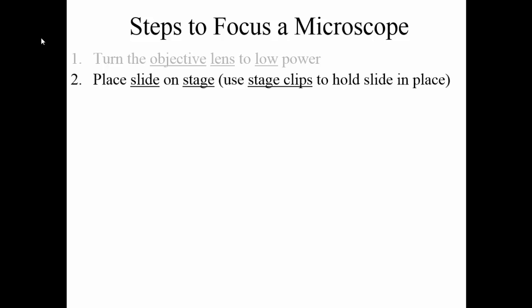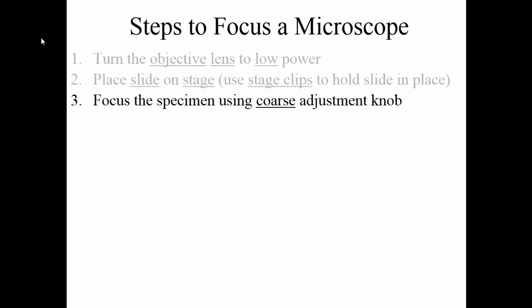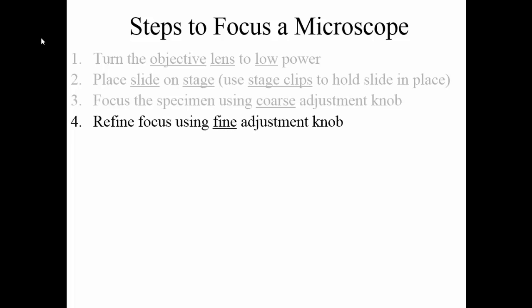Generally we don't use stage clips as much because once you've clipped it, it's harder to move around. I would say don't use the stage clips until you have the slide in a good spot where you're going to actually view and study the specimen for a longer period of time. Once you've got the slide on the stage, you can focus the specimen using the coarse adjustment knob — that's the larger of the two knobs for focusing. Once you have the specimen focused with the coarse adjustment knob, you're going to refine the focus and make slight adjustments using the fine adjustment knob. The fine adjustment knob is not going to do a whole lot by itself — you don't want to start with the fine adjustment knob.